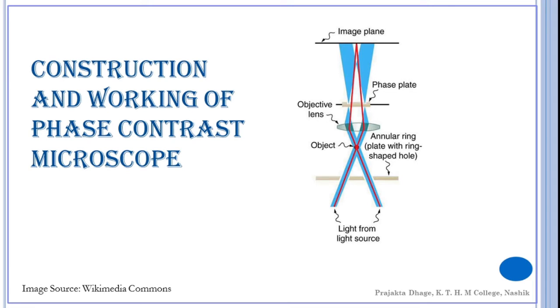In a light microscope, the condenser focuses light rays on the object. In the absence of an object, all the rays will be direct rays. There will not be any diffracted rays obtained. If an annular diaphragm is placed below the condenser, its image is produced at the rear focal plane of the objective. If the eyepiece is removed, the image of the diaphragm is seen at the back of the objective.